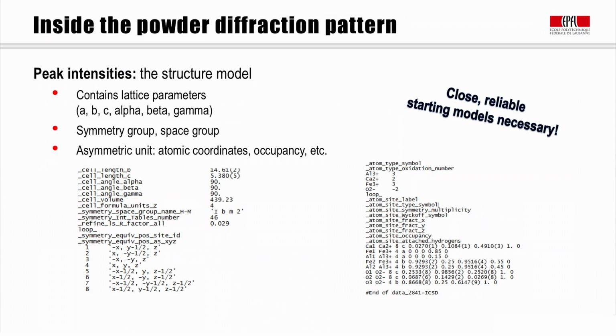When we want to do a proper fitting of a diffraction pattern, it is very important that we have close, reliable starting models. If, for instance, we have a bad starting model, then the calculation routine, the fitting routine, will have a very hard time in finding the correct, refined, fitted parameters in your X-ray diffraction experiment.